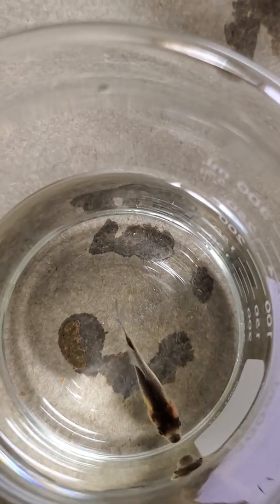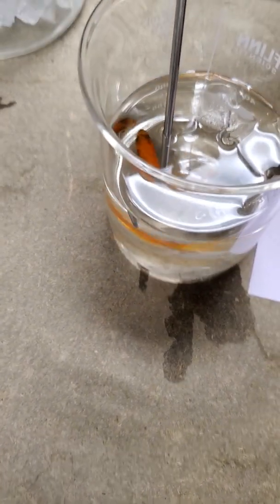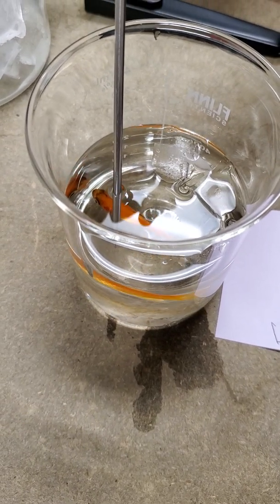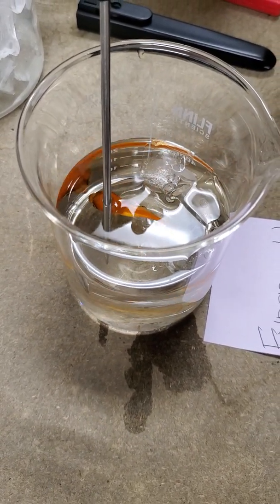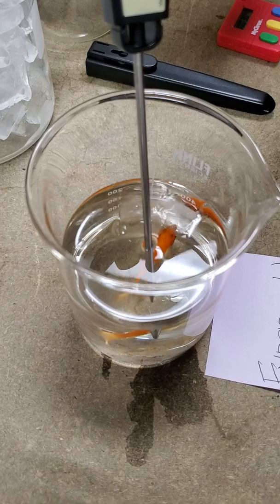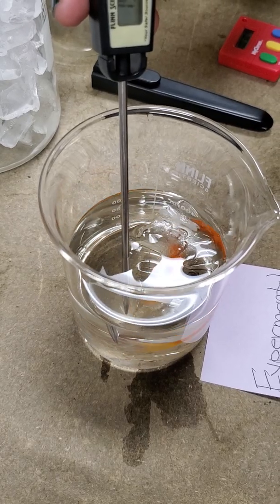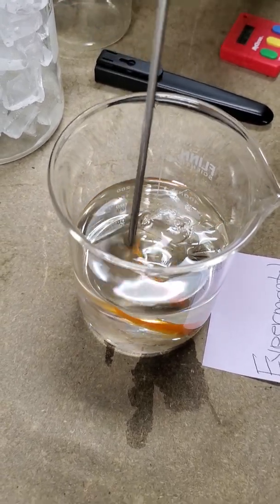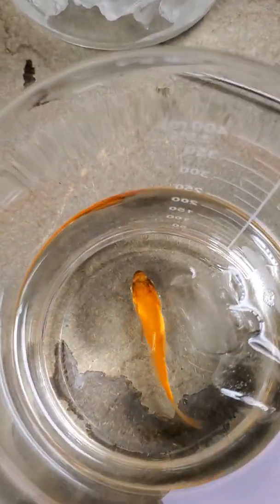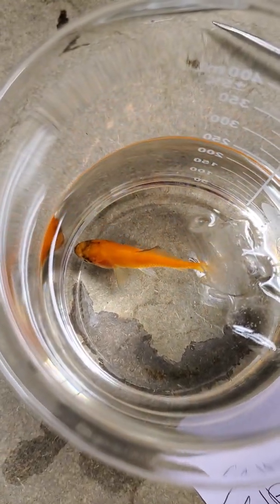And stop counting. Okay, now we are going to look at our temperature for our experimental goldfish. And it is 15.8. So now I'm going to set the timer, and you're going to count the respiration, the mouth opening and closing or the gills going in and out. I'm going to have you count that for 30 seconds.